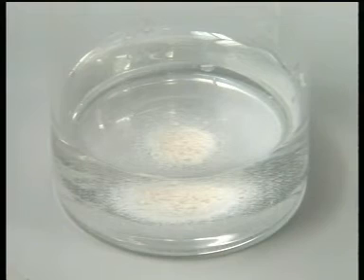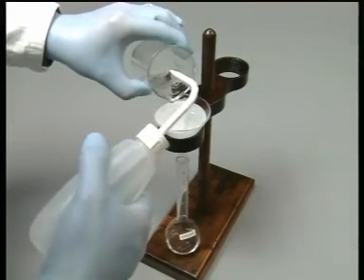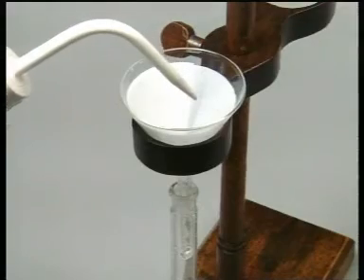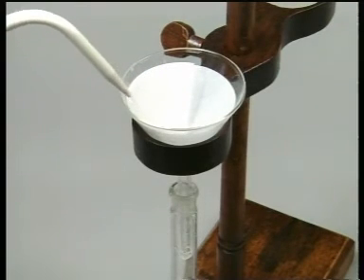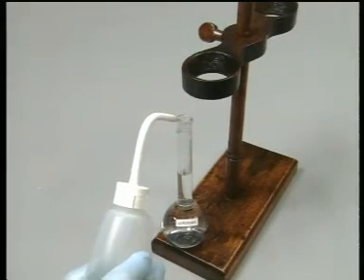If the unknown solution contains solids, it is important to filter it, otherwise the nebulizer may become blocked. It is vital to select a filter paper that will not absorb the ions that will be measured. If in doubt, seek advice. Thoroughly wash out the sample vessel and filter to ensure all the soluble sample is transferred to the measuring flask. Then make it up to volume.